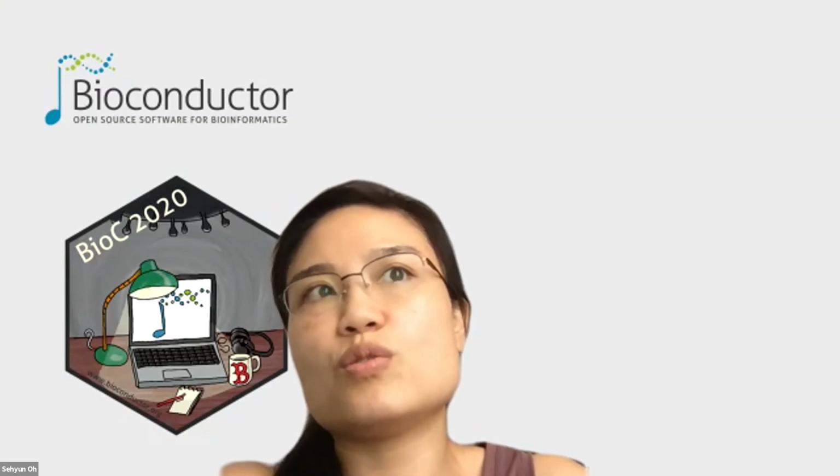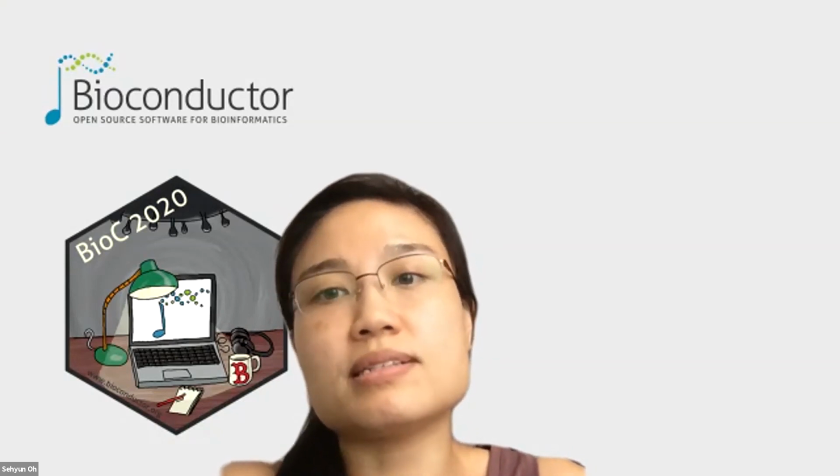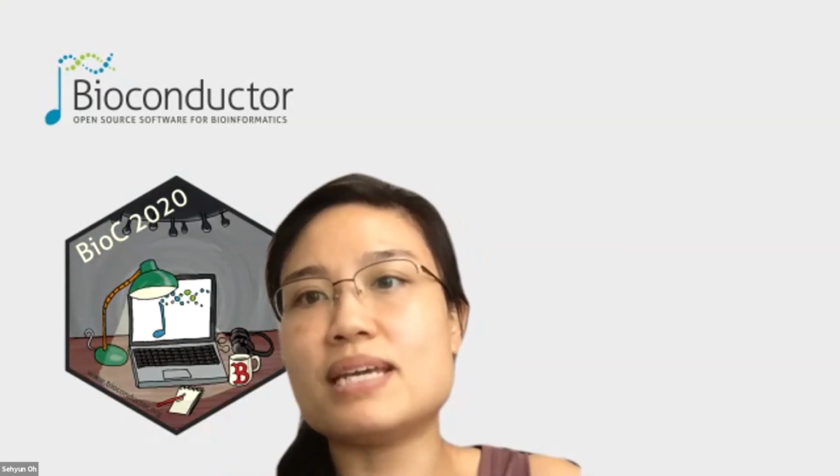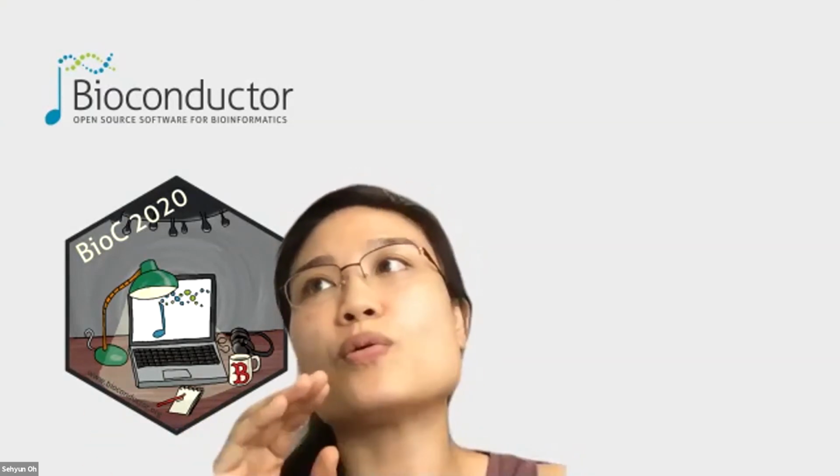Just one side note: because PureCN doesn't use a matched normal, we are assuming that the tumor sample is somewhat contaminated. So a purity of somewhat mixed, like 50% normal and tumor mix, is actually called with the most confidence.